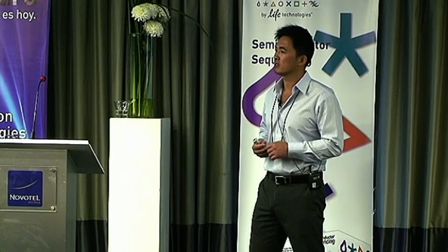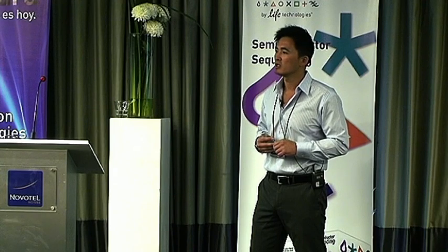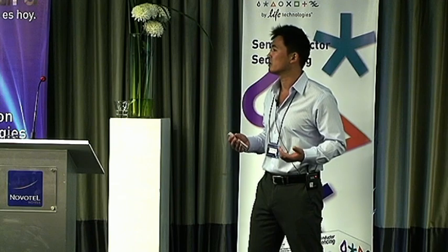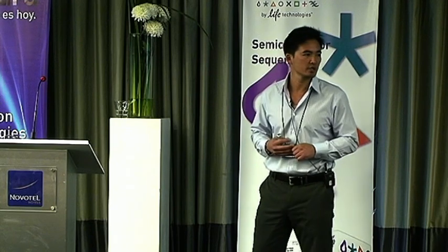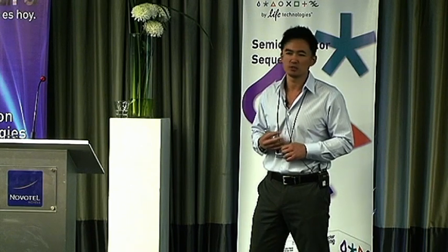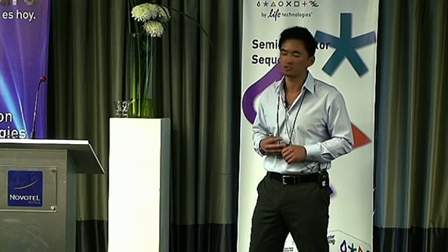So, in the previous poster, I showed you that there's a stem cell applications lab at Carlsbad. They've actually already demonstrated that we can get down to single cell gene expression detection levels by using this preamplification method. The preamplification method has been used and well established in the literature now, I'd say going back 5 or 6 years.